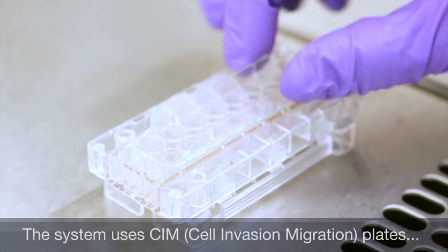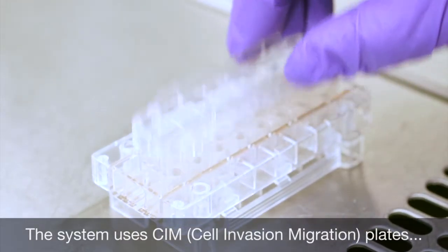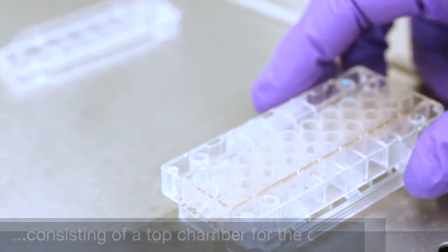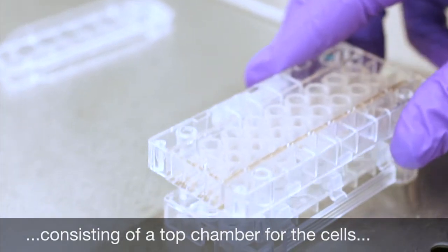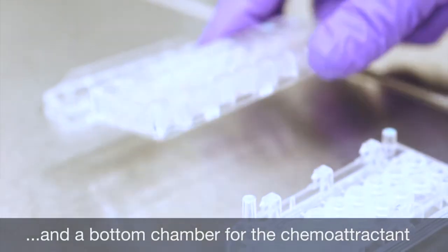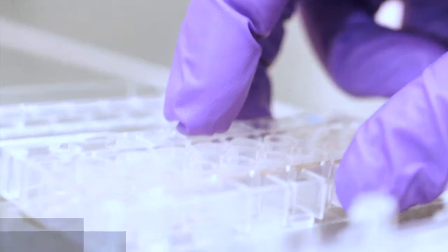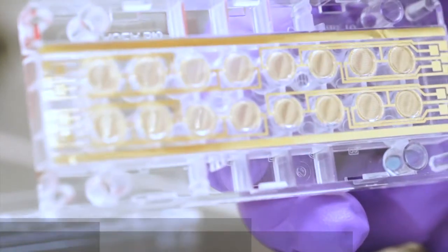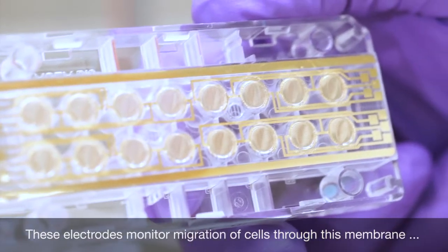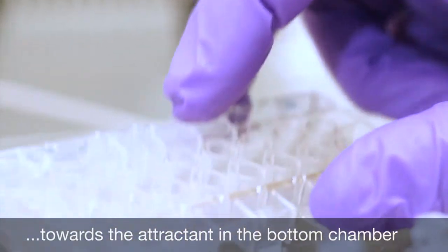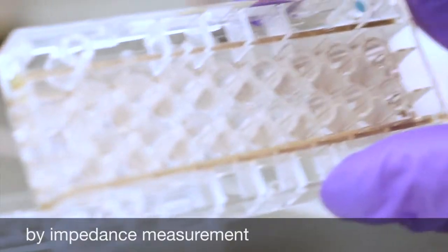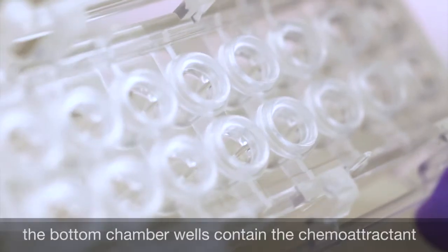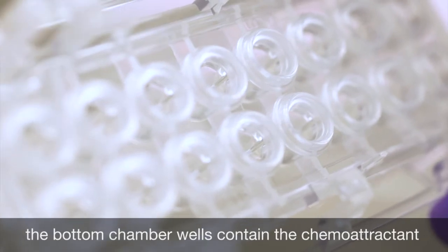A special plate called the CIM-Plate serves as support for the upper chamber containing the cell suspension, while the lower chamber is filled with the chemoattractant. The upper chamber has an electrode at the bottom of the membrane which measures the impedance signal. This way, migrating cells attracted by the chemoattractant pass through the membrane to adhere to the electrode, inducing a modification of impedance values.